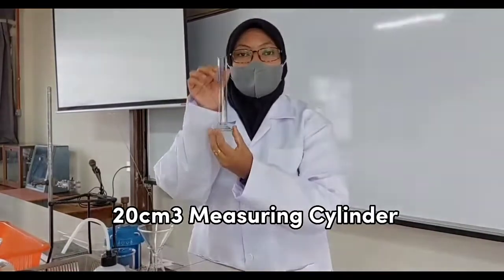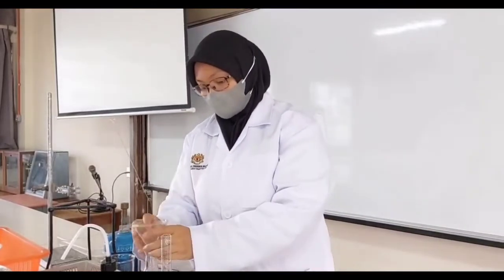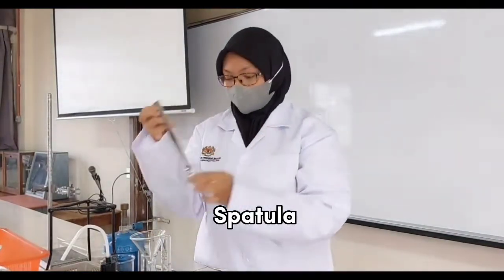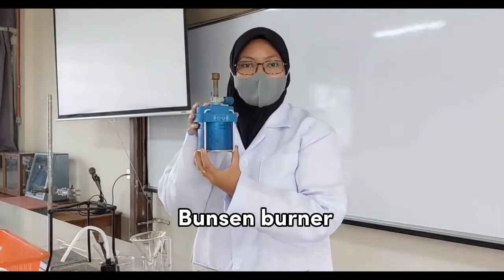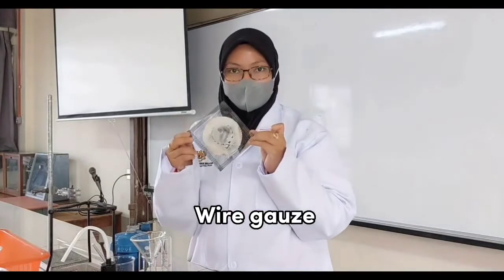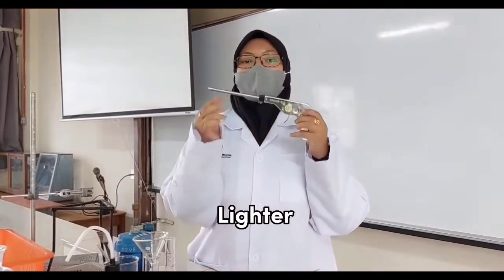Then we move to apparatus. The apparatus are measuring cylinder, filter funnel, conical flask, 250 ml beaker, spatula, glass rod, pipe clay triangle, Bunsen burner, evaporating dish, wire gauze, tripod stand, retort stand with clamp, and lighter.